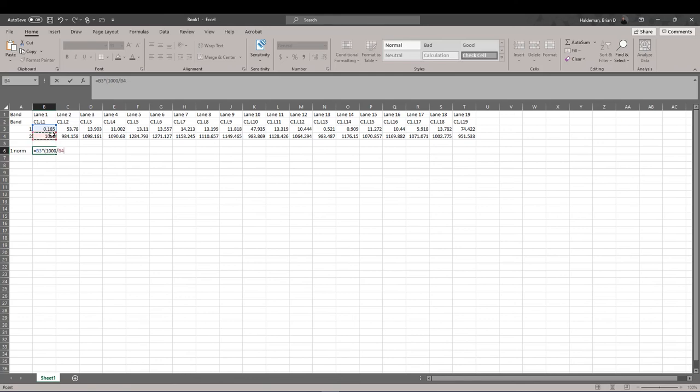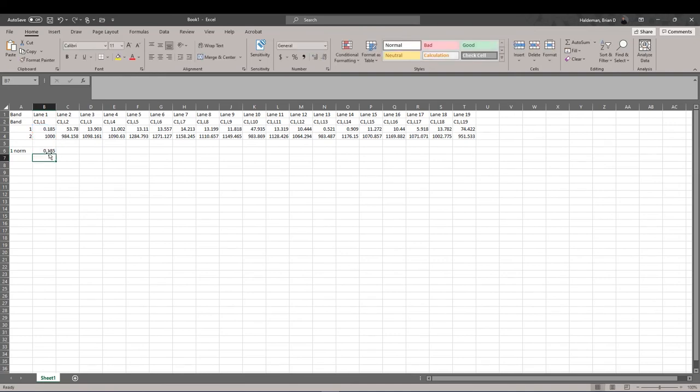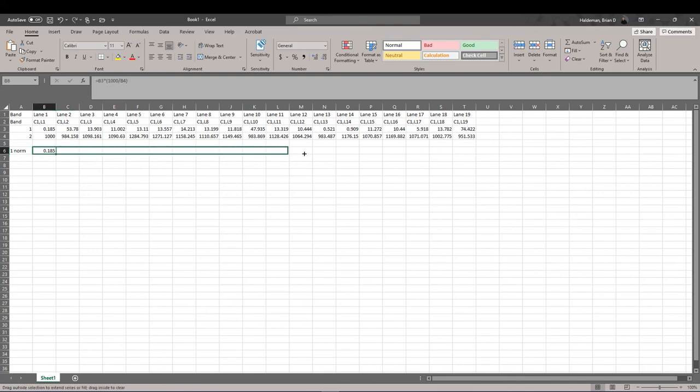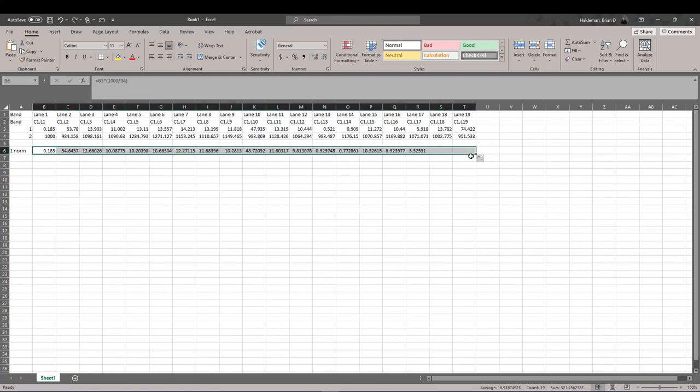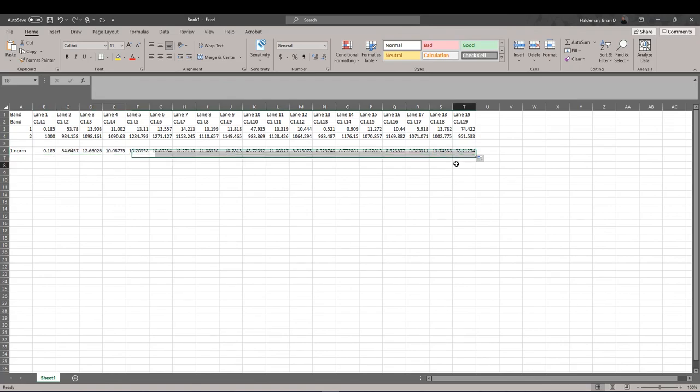In this case, I will choose B4. We can now use that same formula for the rest of our lanes to get our normalized values of our bands of interest.